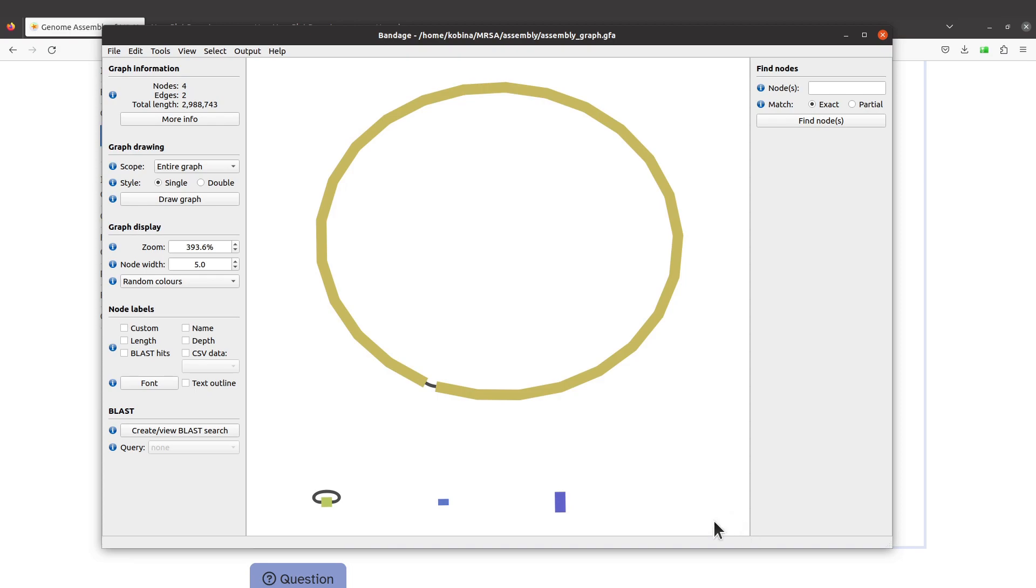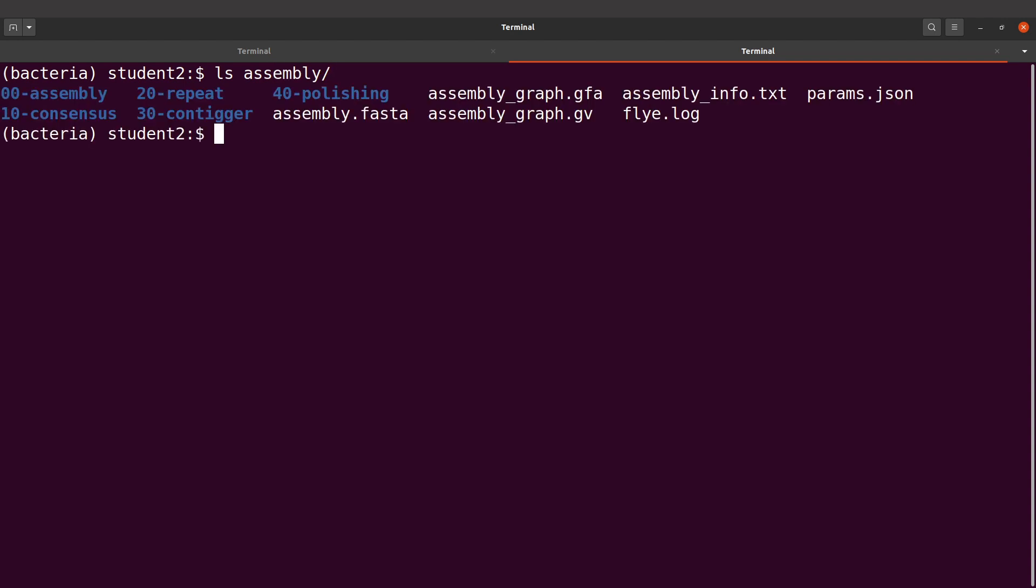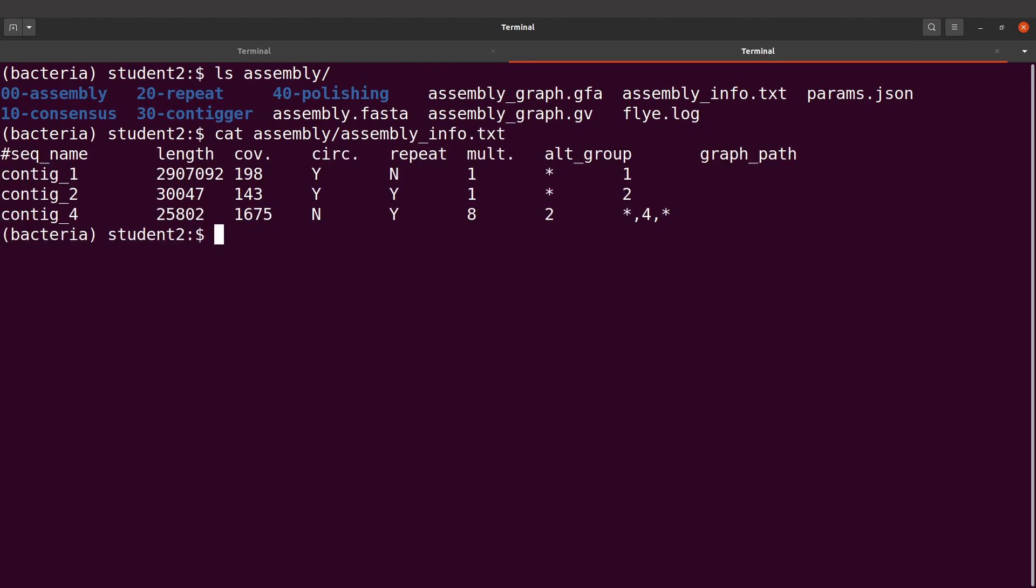Let's proceed. Remember when we displayed assemblyinfo.txt, we had some information coming up. Let's do that again. I'll say cat assembly/assembly_info.txt. We have the length, we also have coverage, we also have the contigs here.